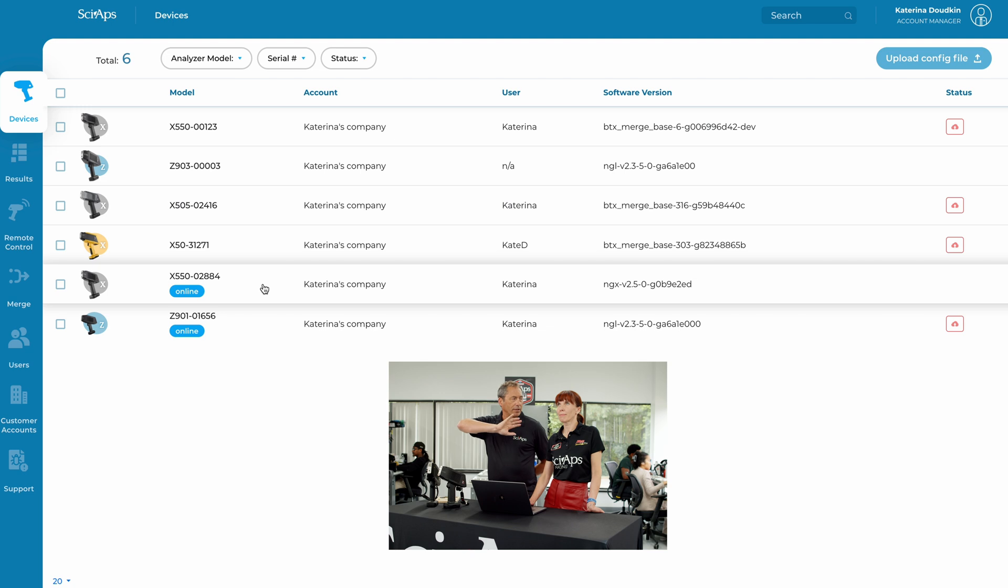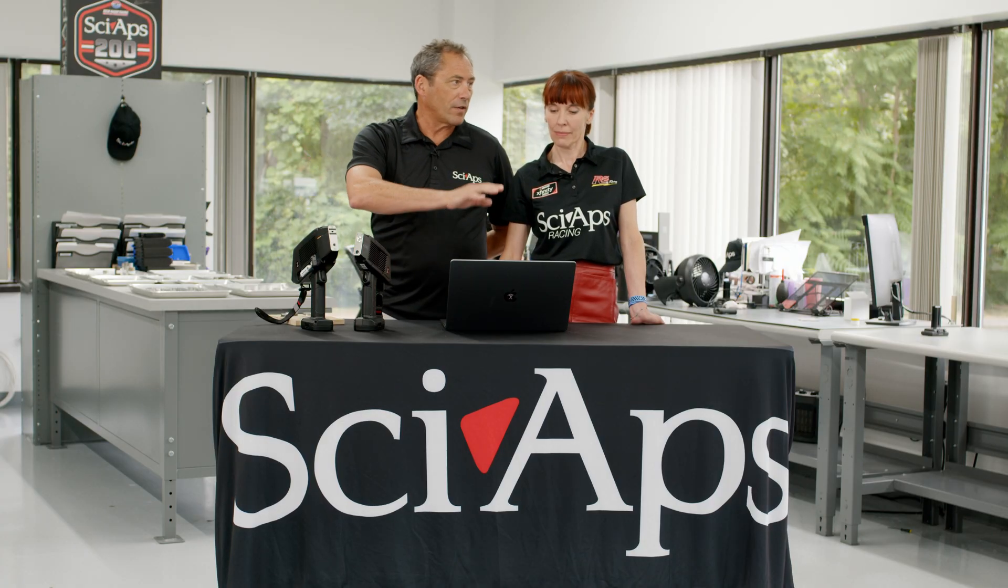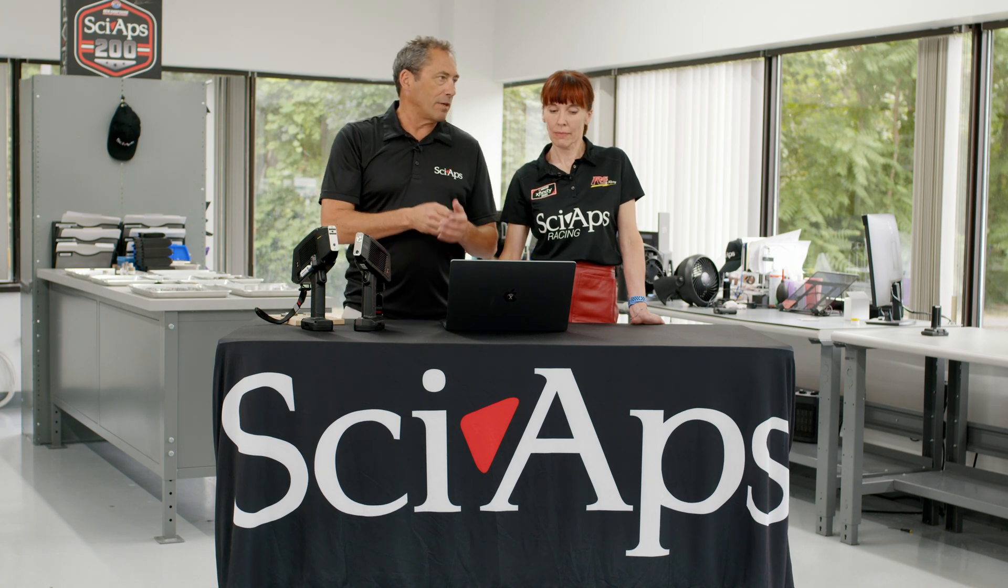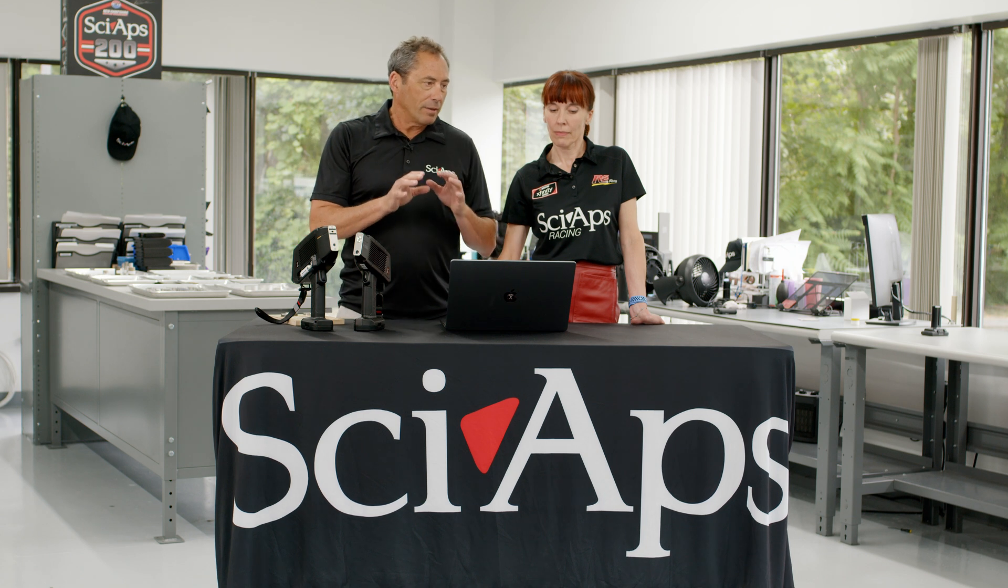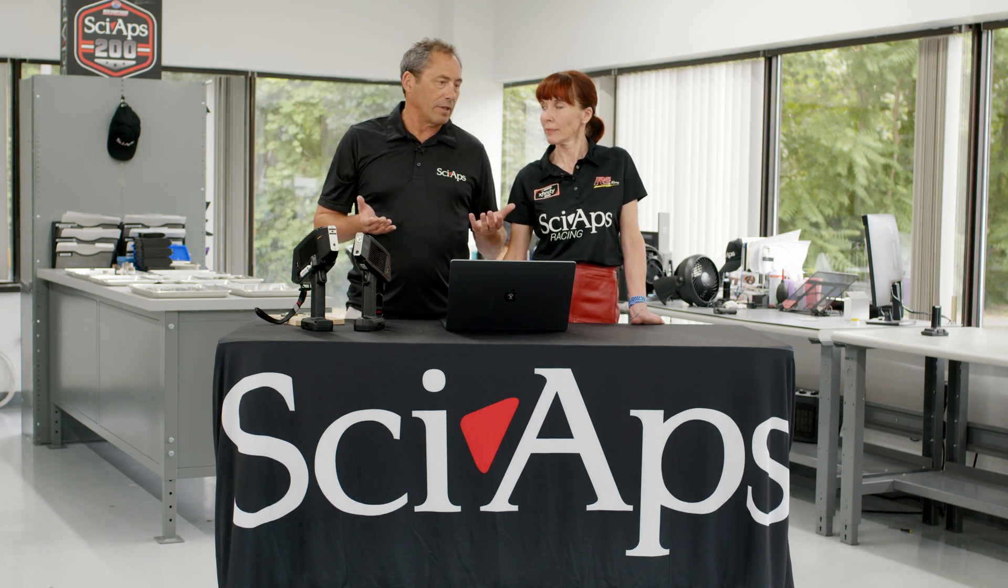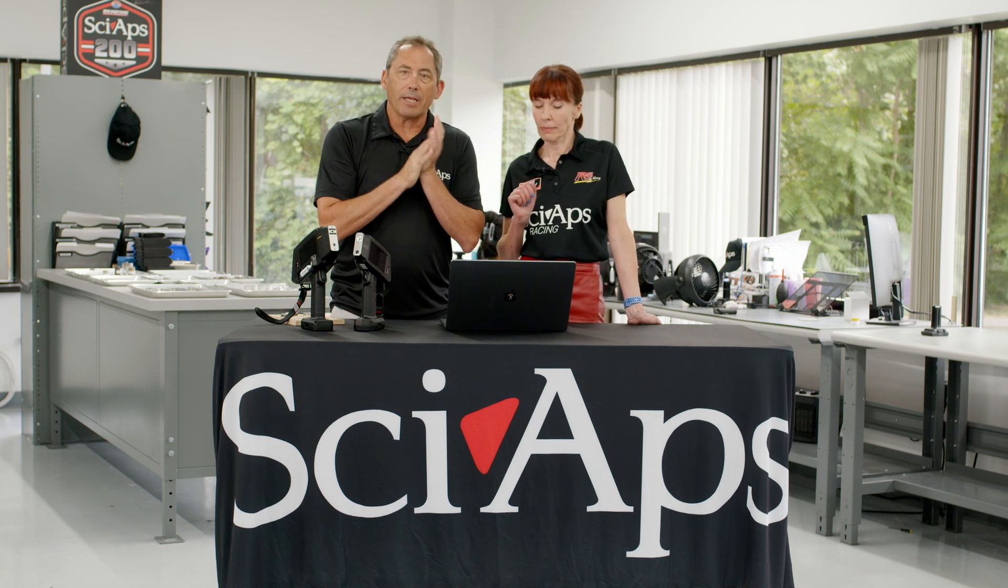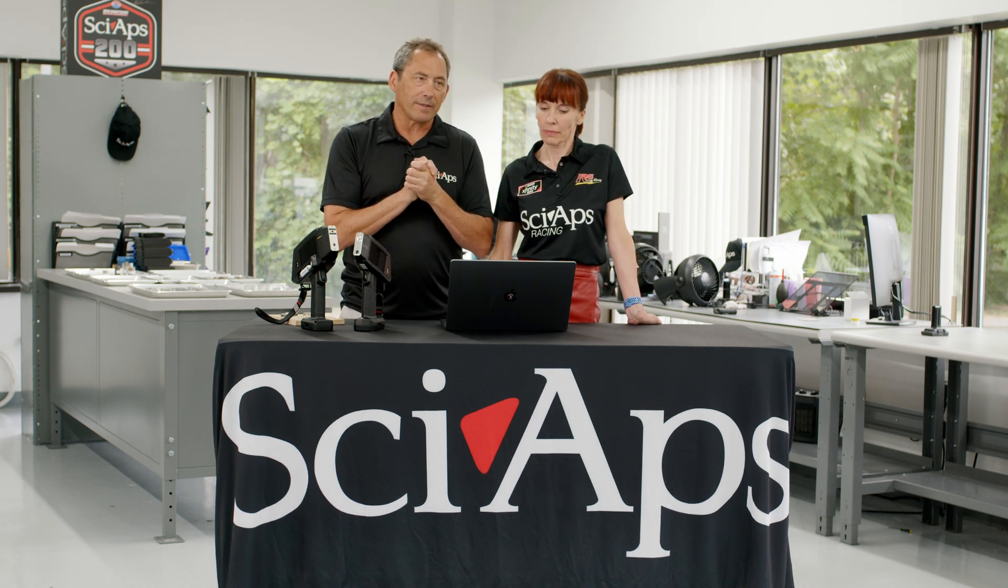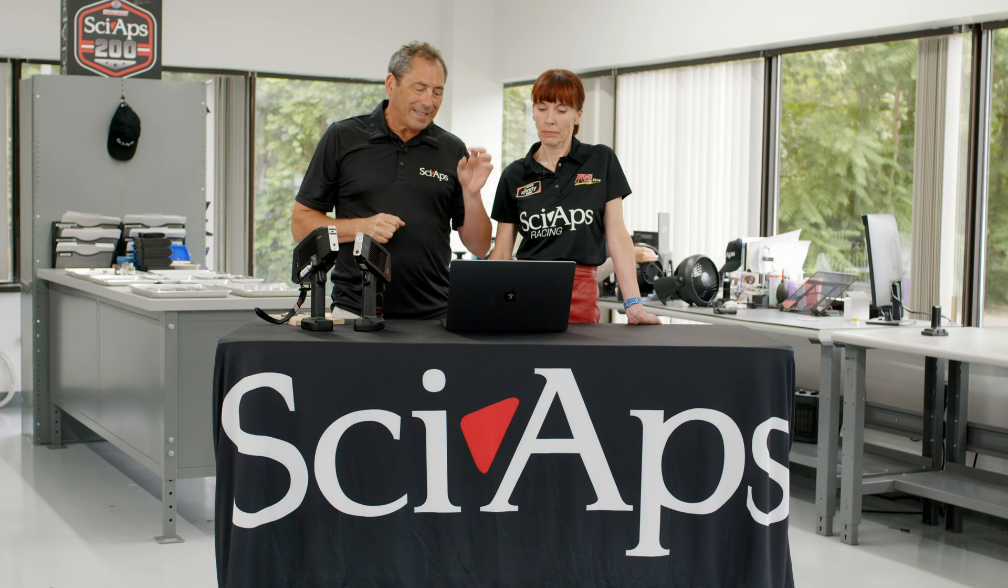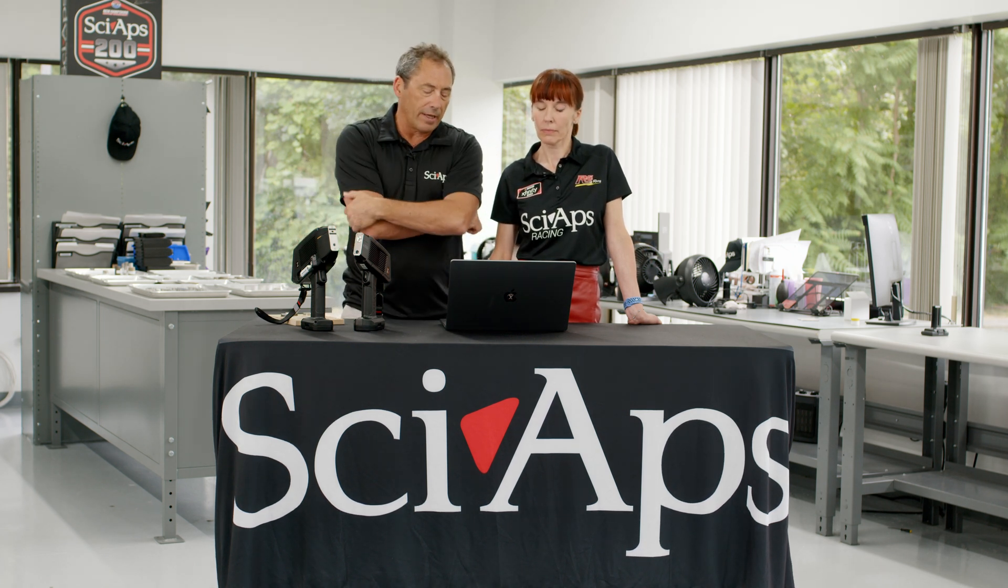So I just want to show something that is really nice. So let me just summarize because basically people, you got a bunch of guys in the field. You can make sure they're doing their work. You can look at their tests in real time, especially for carbon where sample prep and grinding is so important. You can really make sure they're getting, you can tell them, hey, go test these standards first. I want to look at the results. So you can really make sure they're properly doing the sample prep and properly doing the testing. So they don't come back after several days of work and you find out a lot of it was wrong.